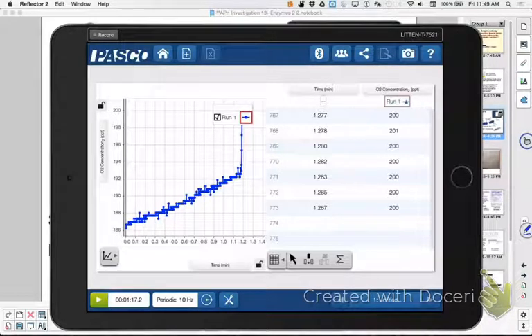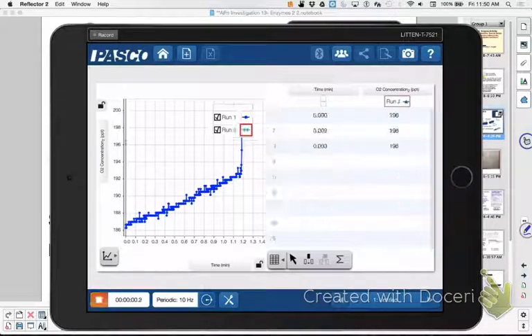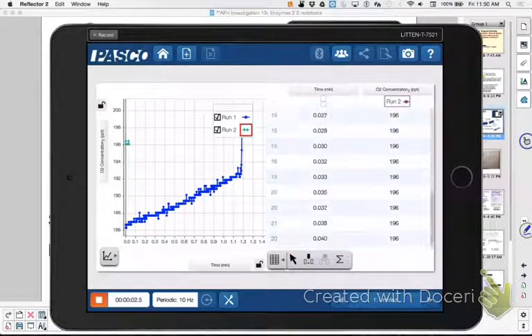Now, watch this. I'm just going to take the sensor off of here. And that's one, which I need to fix. Okay. Now, I just did half water, half hydrogen peroxide in this one. Got my 0.5 mils. Putting in my catalase. Don't put it on too tight. Notice it's starting a brand new run. Why did it start so much higher up? That was its initial amount of oxygen that was in there.